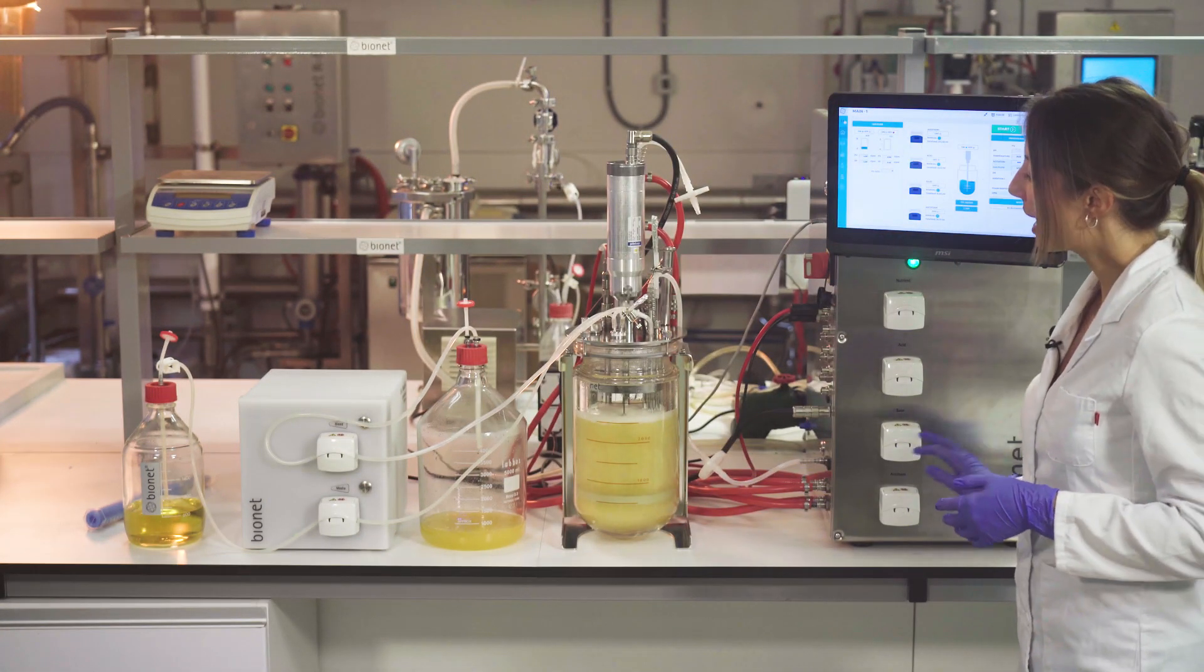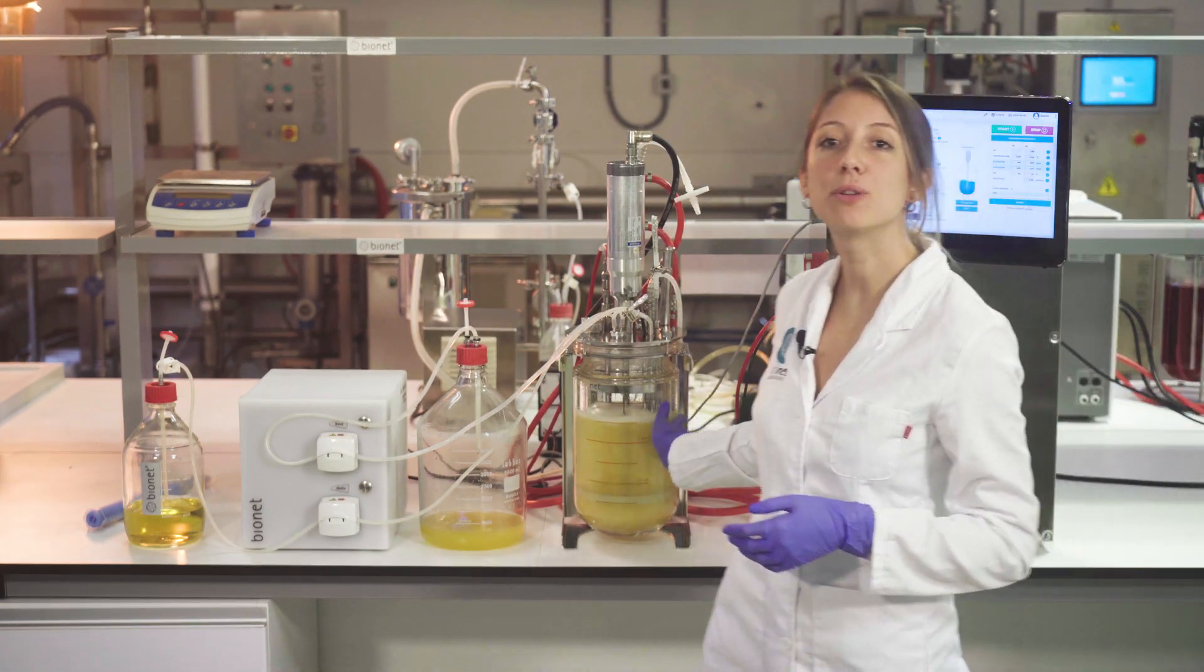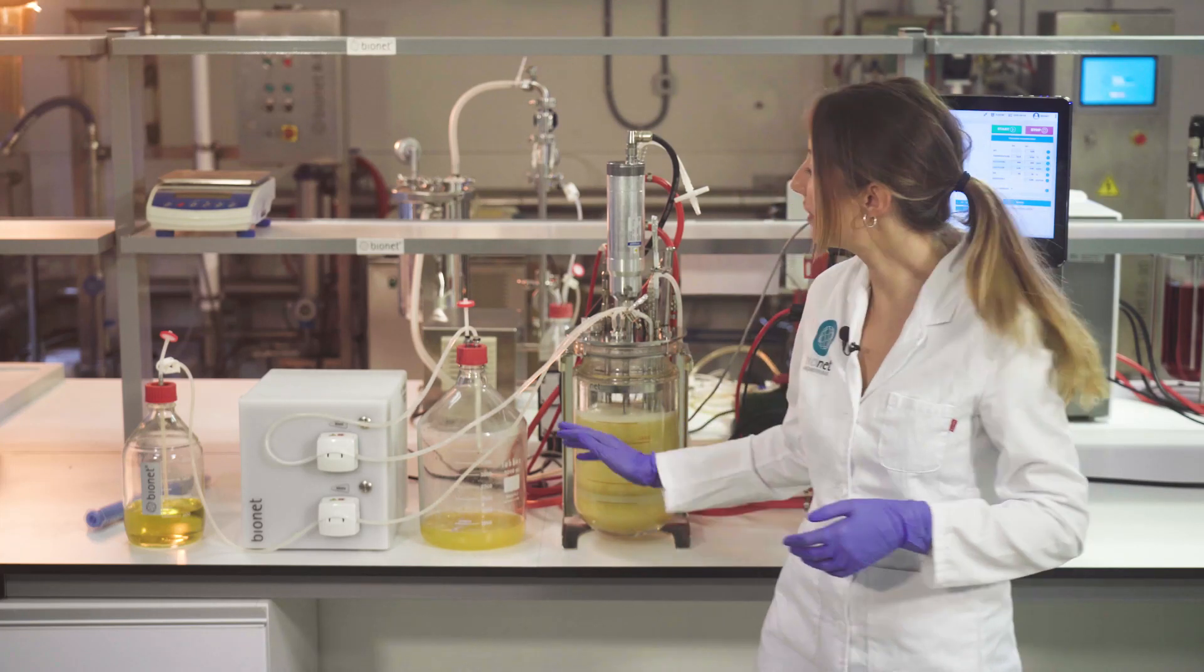Here we have a setup with Bionet's F1 bioreactor model, a vessel of a working volume of 3 liters, working together with a continuous process module, also by Bionet.